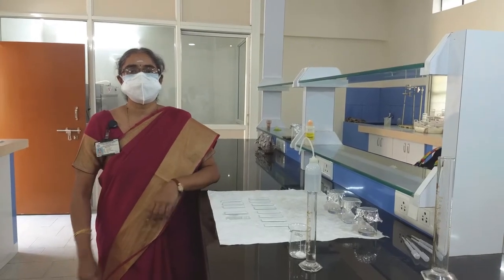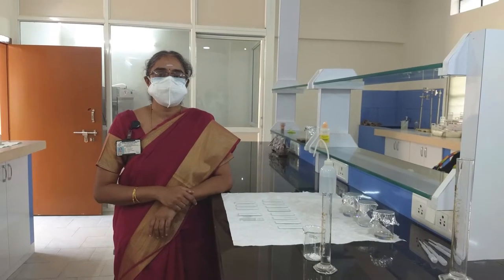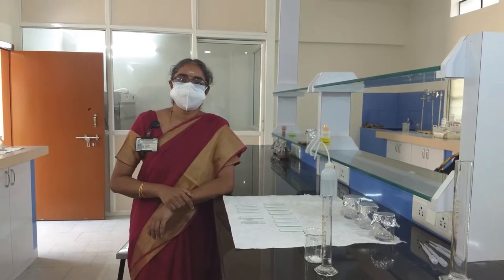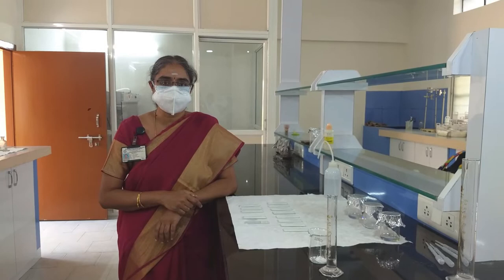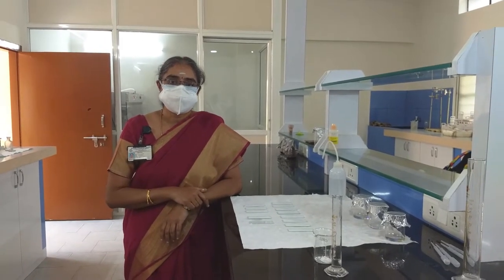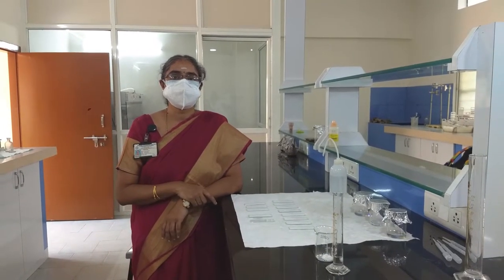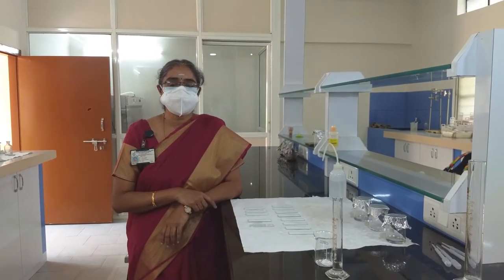The experiment: separation of plant pigments by thin layer chromatography. Plant pigments are present along with water in the leaves. We use a mobile phase prepared with an organic solvent to extract the plant pigments from the sample, and then we separate them using thin layer chromatography. There are a few requirements for TLC.